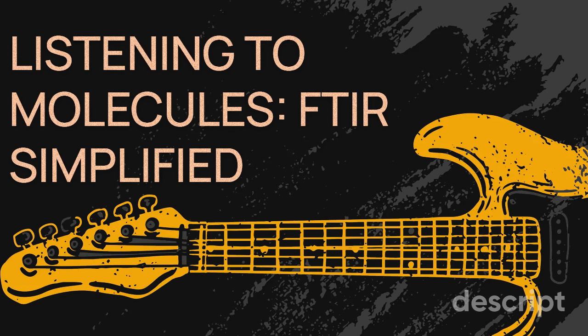function. This is all really cool, but I have another question. Can FTIR detect changes in the protein structure? Absolutely. Like what if the protein's environment changes or it binds to something? Proteins are dynamic molecules constantly interacting with their surroundings, and FTIR can capture these dynamic changes. For instance, changes in temperature, pH, or binding to other molecules can all induce shifts in the protein structure. And these shifts will be reflected in the FTIR spectrum, especially in the amide band.